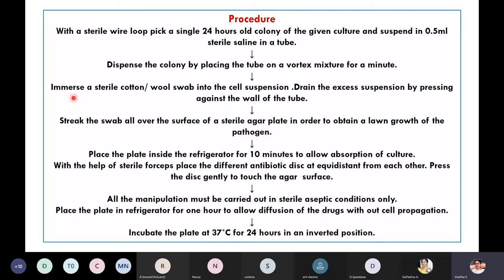Coming to the next step: take a sterile petri plate. The media has been sterilized and prepared — once it comes to 45 degrees centigrade, pour the culture media onto the sterile petri plate. After that, label it clearly, marking the antibiotics you are using on the petri plate. Then allow the culture media to solidify.